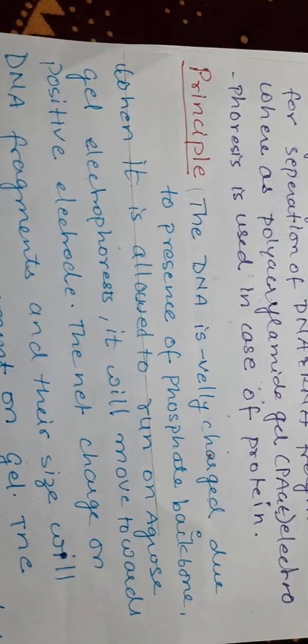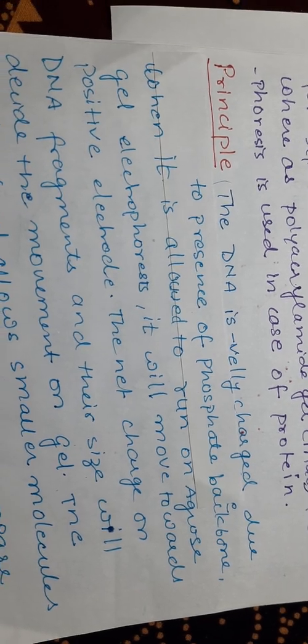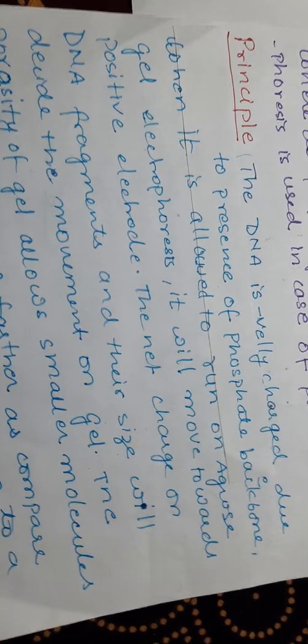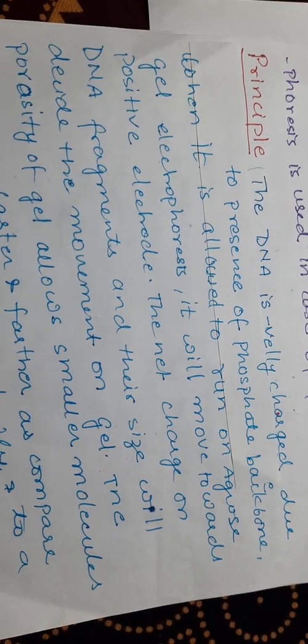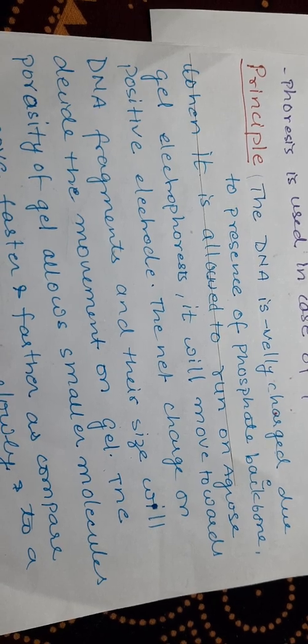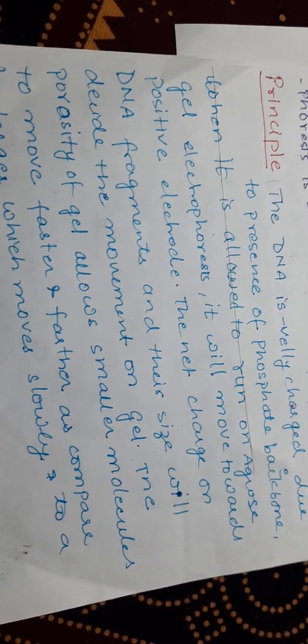Let's see the principle behind this process. The DNA is negatively charged due to the presence of the phosphate backbone. So when it is allowed to run on agarose gel electrophoresis, it will move toward the positive electrode. The net charge on the DNA fragment and its size will decide the movement on the gel.